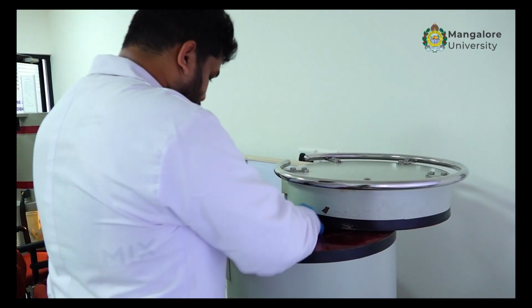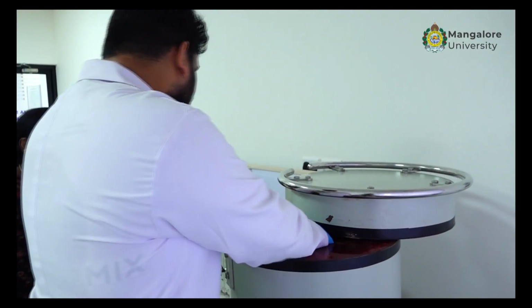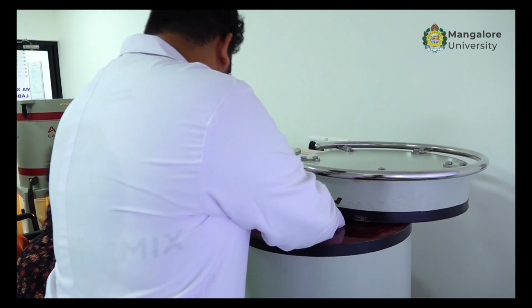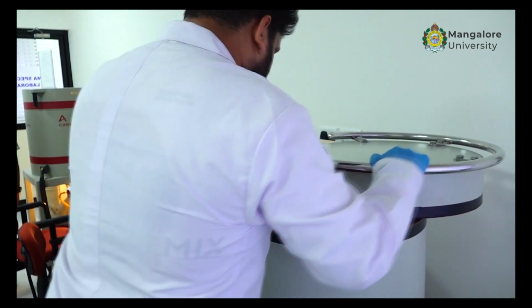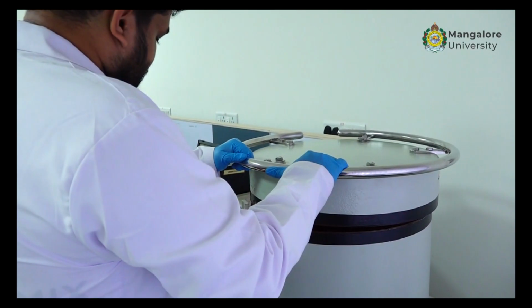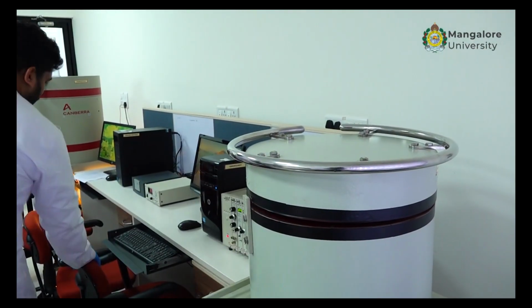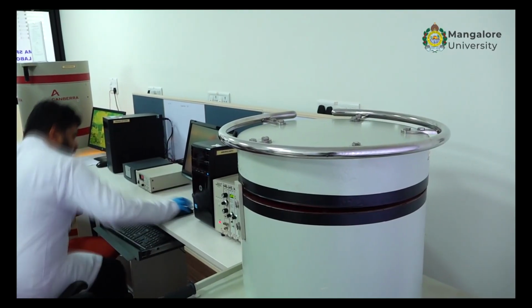One minute. It's a flat surface. Yeah, it is a well type detector. I had shown you, no? So I've kept it. I will show you later. Okay, so I've kept the source carefully. I have to close it. It's very heavy. It's lead. So now what I will do is I'll just show you the spectrum first.